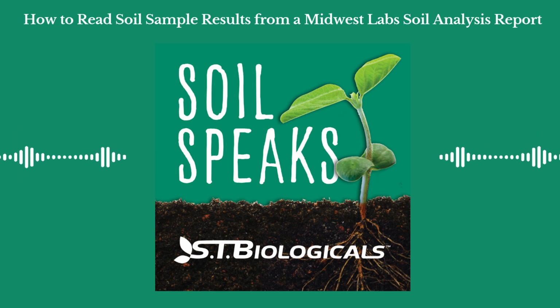What do you do if you're a soybean farmer and your soil tests come back acidic? The short, simple answer is to add lime. The Midwest Lab soil analysis gives you an estimation of how liming can change your pH with the pH buffer information. Soil pH determines the availability of many nutrients. Most nutrients are more plant available in the neutral pH level of 6.5 to 7.5.